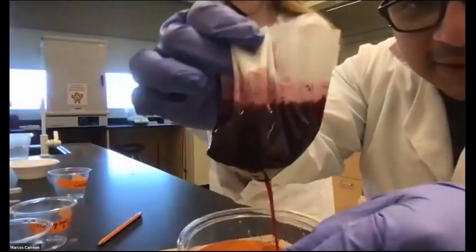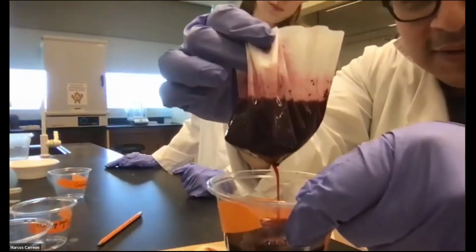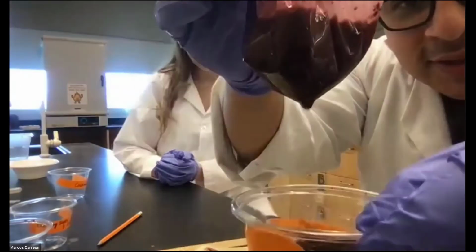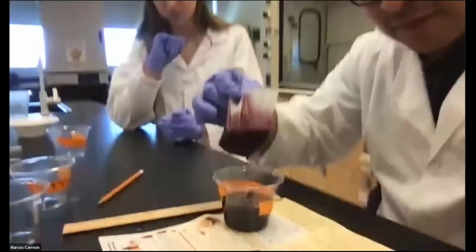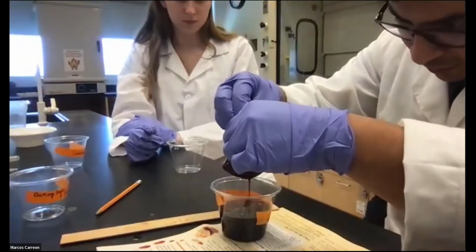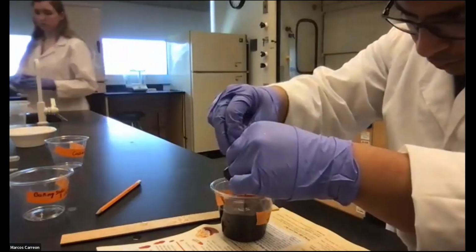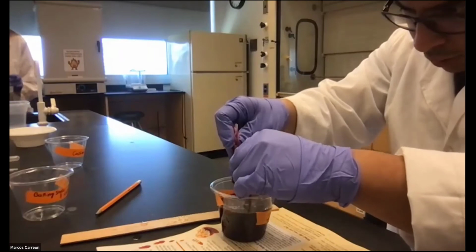So as you can see, this is what we're doing. Hopefully I don't spill this on my laptop, but you can see some of the bugs are on the filter and the solution is going through. So I'm gonna try and do this faster by squeezing the filter. Once you do that, you will have to use your bigger bag. They should look something like this. It's like very fine powder or dust.